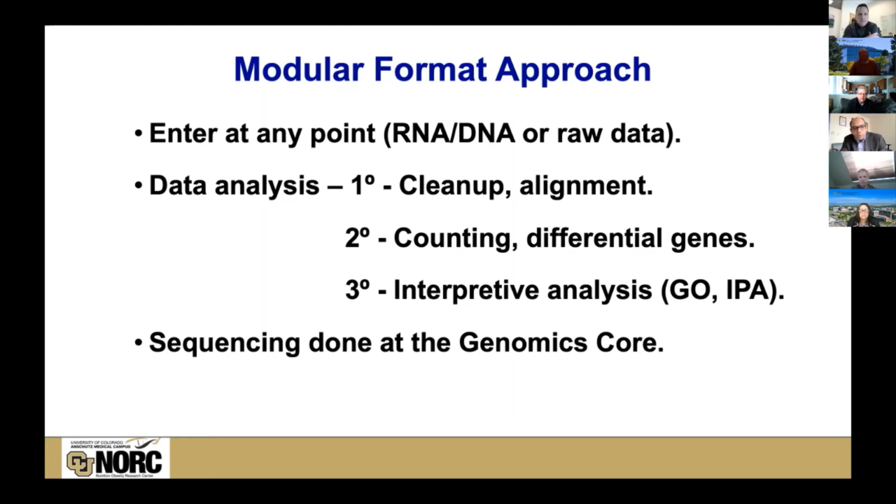We also have two RStudio servers in the lab that have a lot of R packages that can then be utilized for typically the second and the third steps of this process. And like I mentioned, we partner with this genomics core for sequencing. We don't do any sequencing within this core.